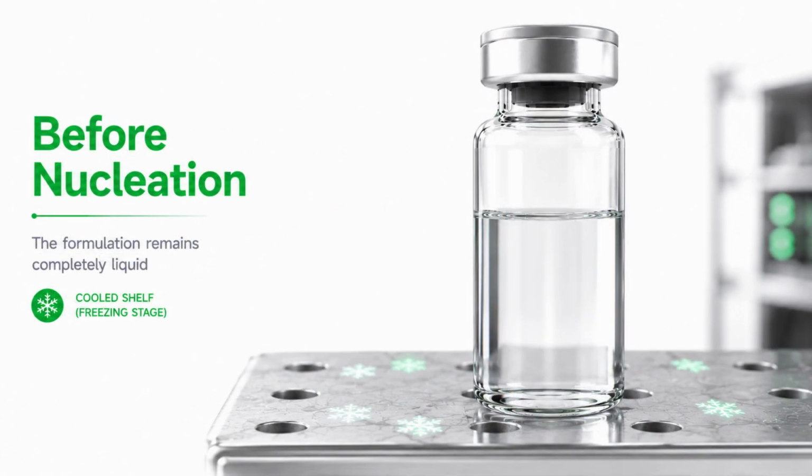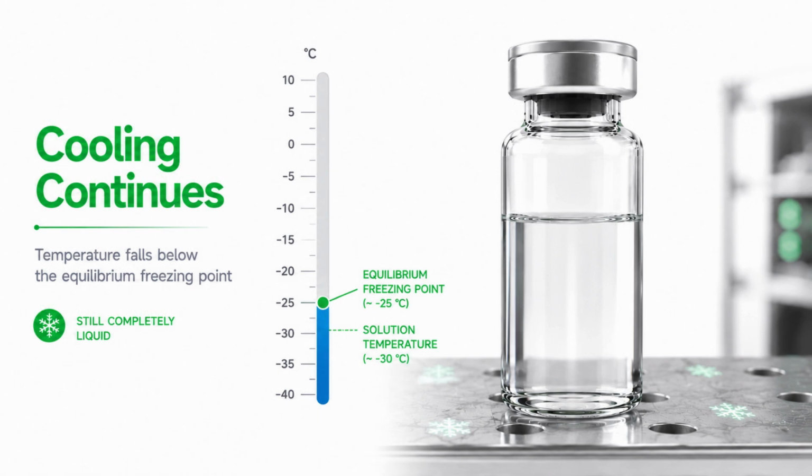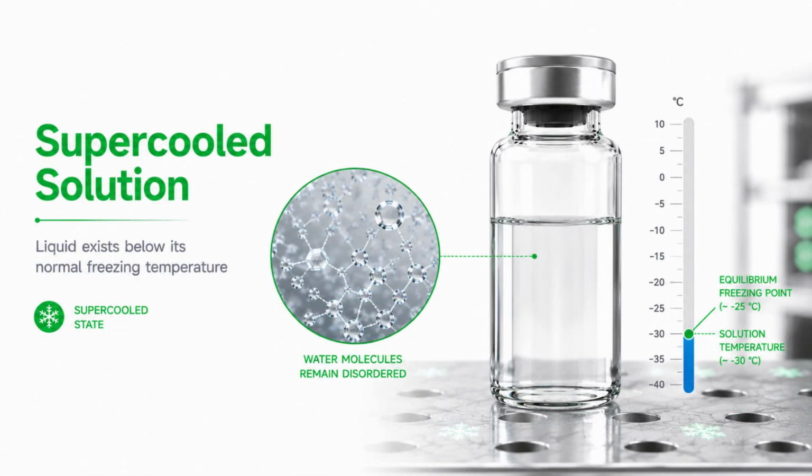As a formulation cools, it does not immediately freeze when it reaches its equilibrium freezing point. Instead, the liquid often continues cooling while remaining completely liquid. This state is known as supercooling.